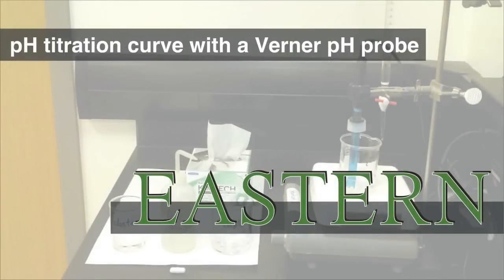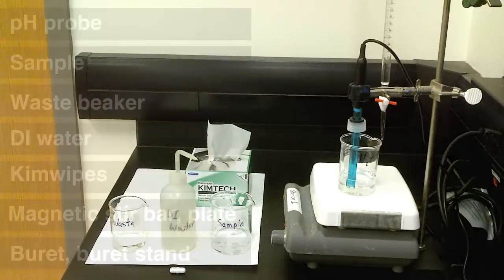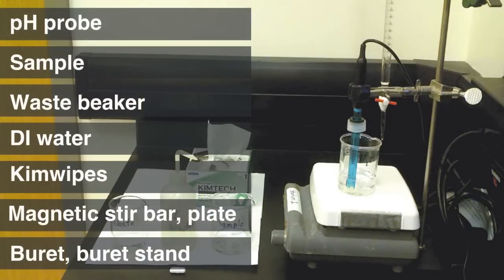Okay, now we're going to use the Vernier pH probe to create a titration curve. You're gonna need a few things so let's get it together, alright?